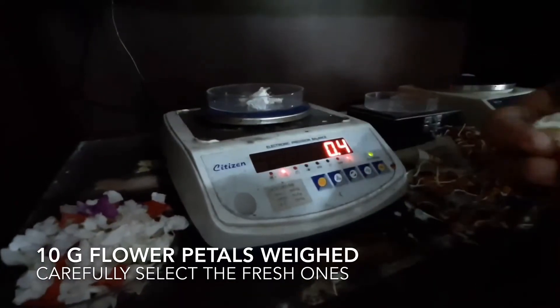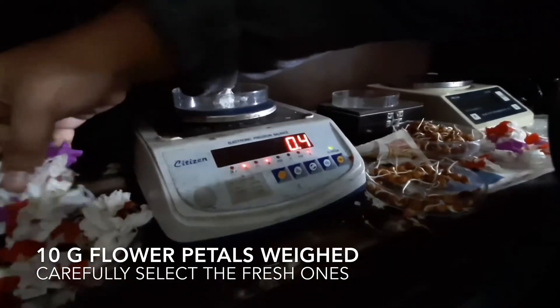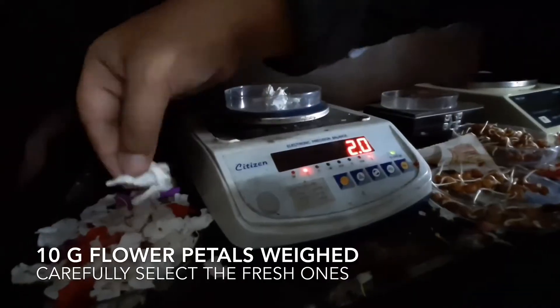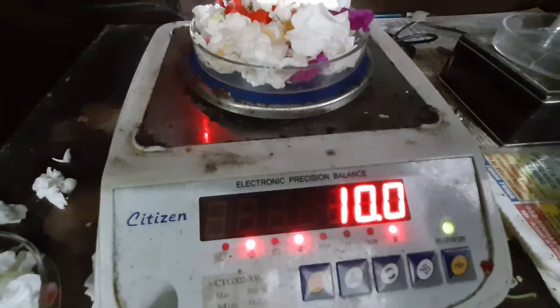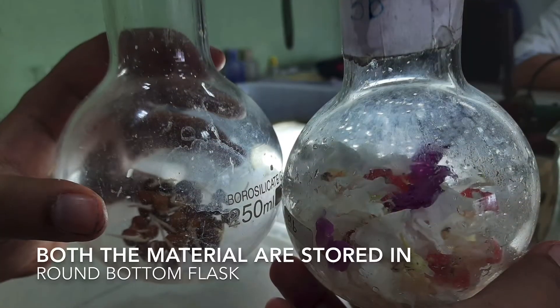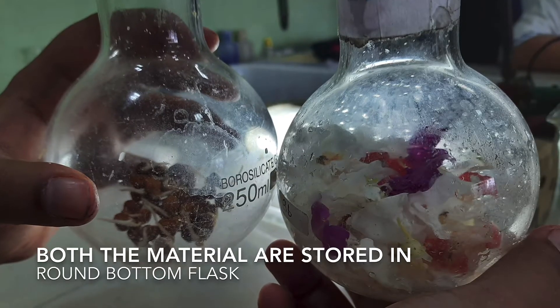10 grams of the flower petals are weighed, and here also we will carefully select the fresh ones. Both the weighed plant materials are now kept separately in two round bottom flasks.